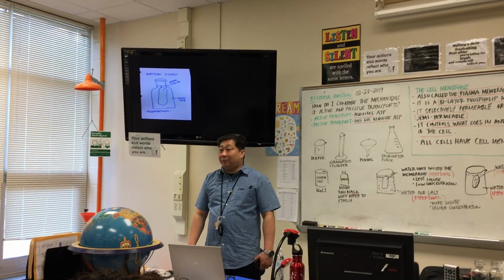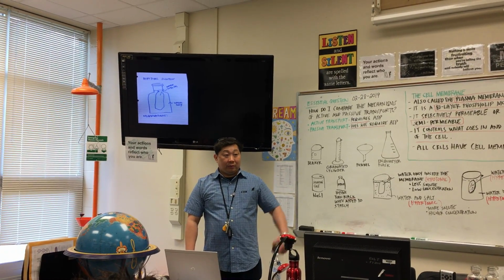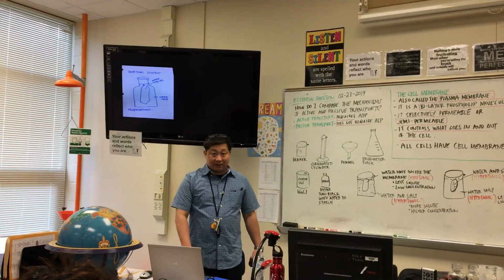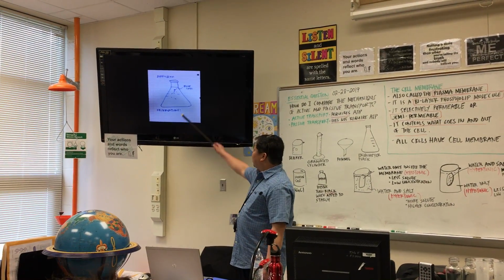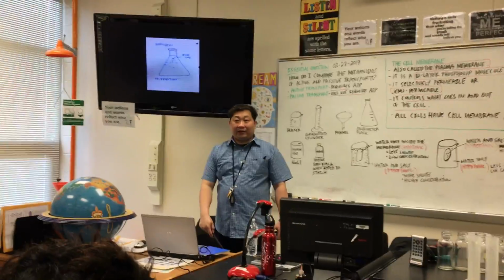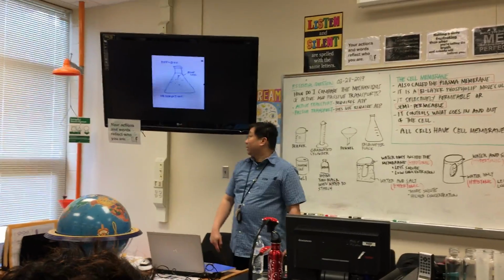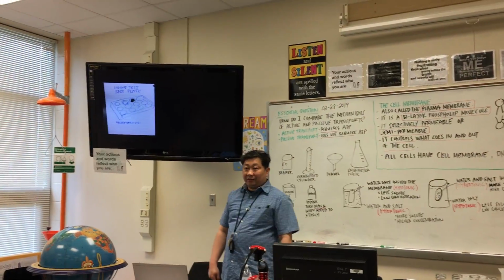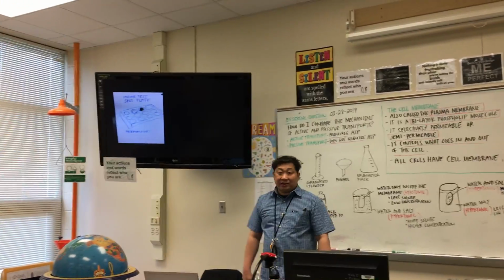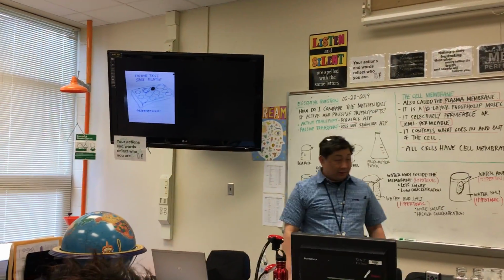It will take time for the observations because the process of active and passive transport takes time. And this is another drawing. This is the Erlenmeyer flask. And we'll be using this for diffusion. And then this is the spot plate. Okay? So, these are the things that we'll be doing today.